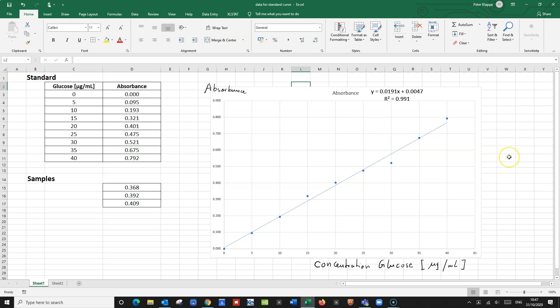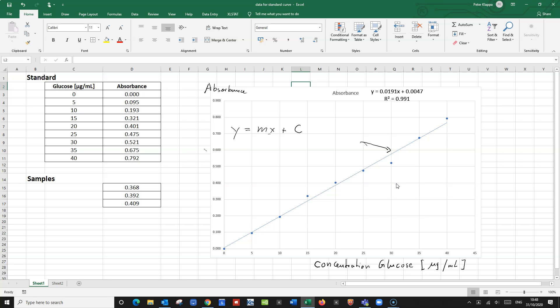So what we now can do is use this correlation to calculate what the concentration would be for our samples that we measured. There is a very simple trick to that. The equation for this line of best fit is Y equals Mx plus C — that's the general equation for a straight line — with M being the gradient and C being the intercept.